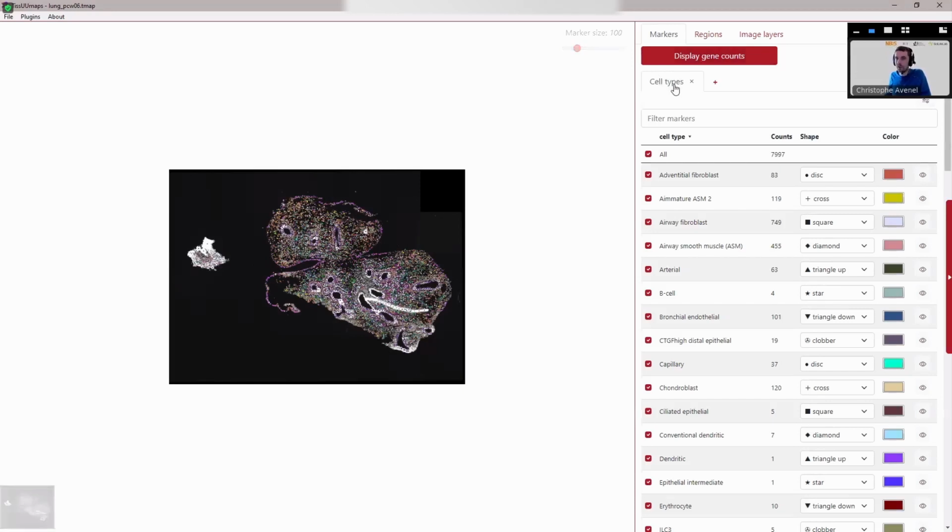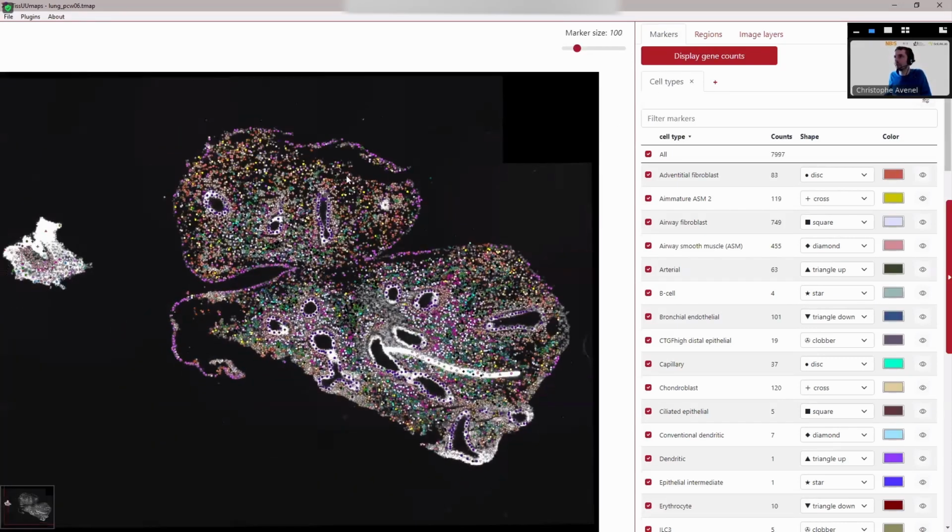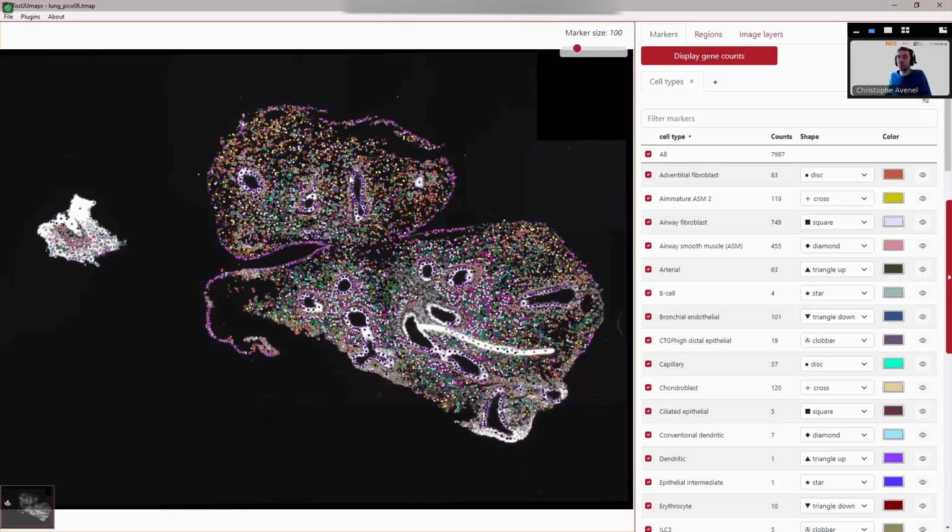We don't want to do that automatically because sometimes the CSV can be quite huge, like hundreds of megabytes. And if you share that online, you don't want to force people to download all the CSV files by default. So that's why we go with the button, so that people can select the files they want to display when they open the image.